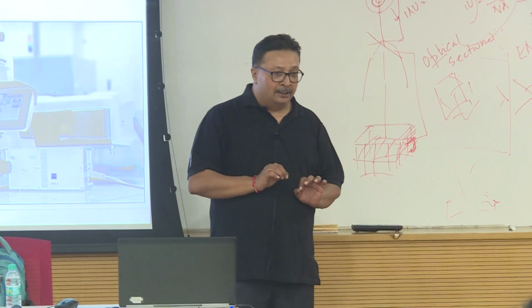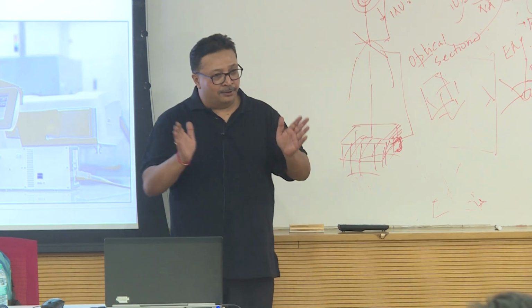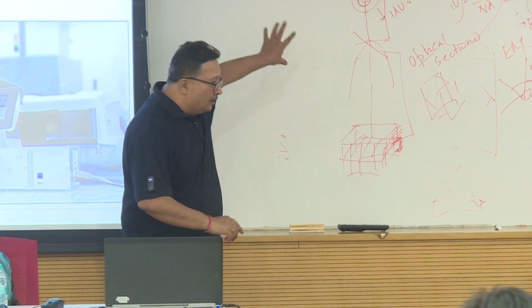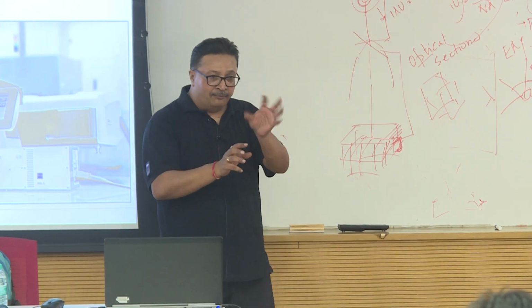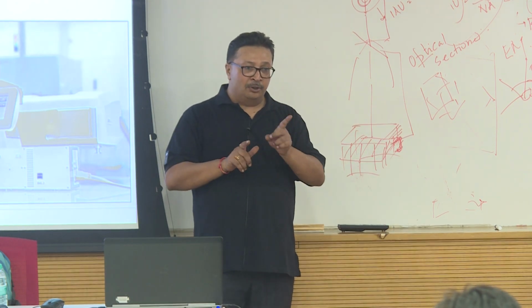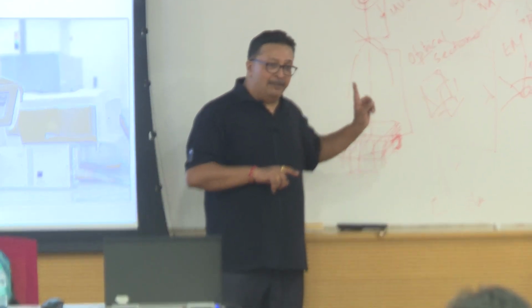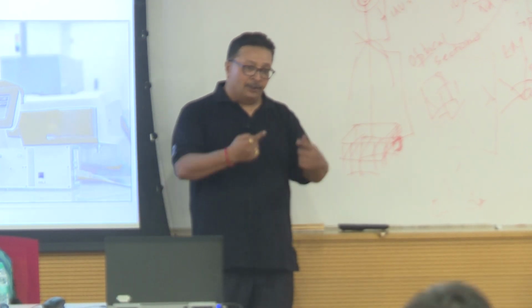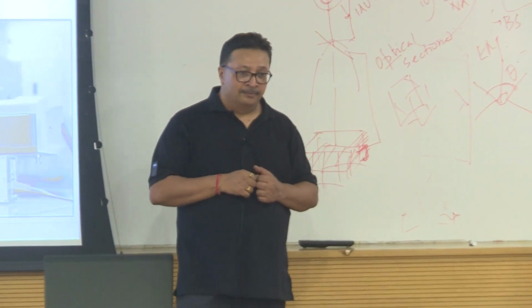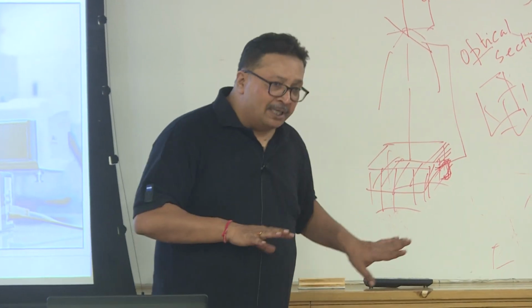So the first thing, the time you come in the room to set up the system, you put the sample on the microscope, and it's a fluorescence microscope. You visualize the sample in the fluorescence mode using the white light and the magical filter that I showed you, select the region of interest that you want to image, and then you go to the confocal mode with the laser getting excited. Because the time the laser starts scanning the sample, your eyes cannot visualize it, as your eyes will be hurt if you see the laser. So it's a pre-inspection tool, and for every sample you don't need a confocal.